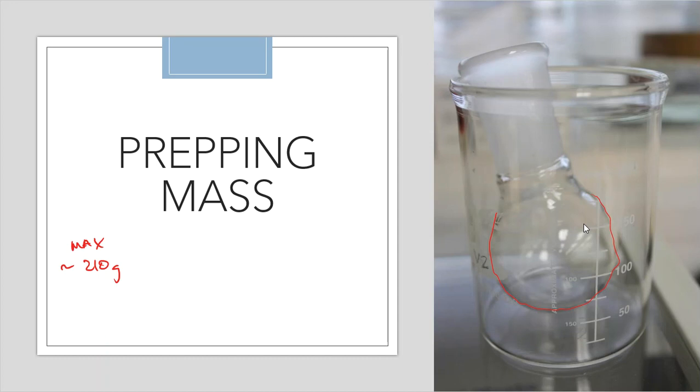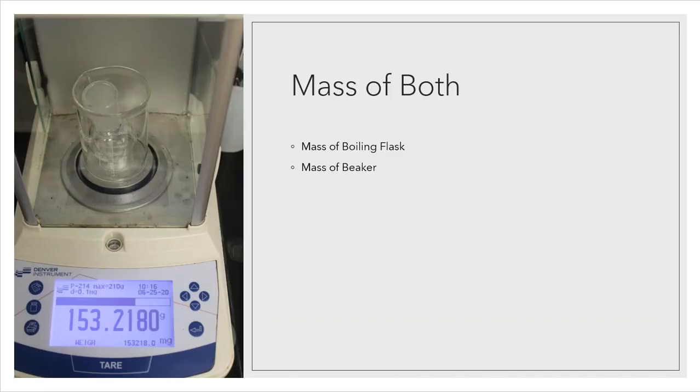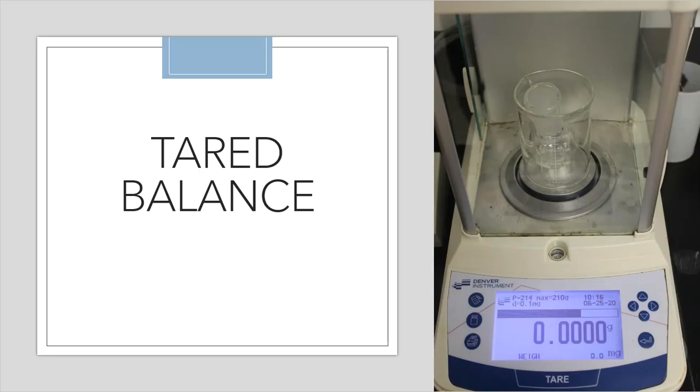All right, so I took the boiling flask and I put it into a beaker just so it will hold it up. And then I took that whole assembly over to my balance, and I did get a mass of it. I told you, anytime that I do this, I write down masses. I might not need them, but here it is, 153.2180. So that's the mass of the beaker and the boiling flask. All right, and then I tare that out. And the reason I tare it out is because I want a direct read of the trans-cinnamic acid that I'm getting ready to add into that flask.